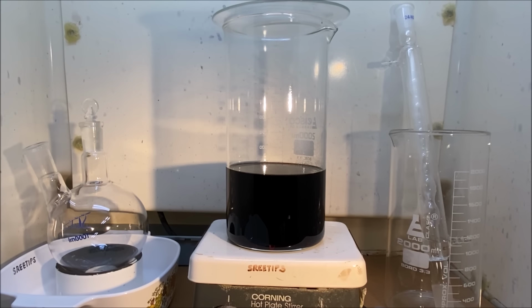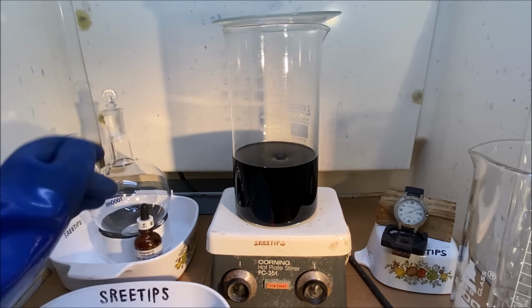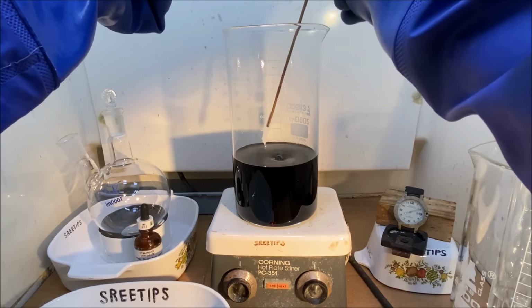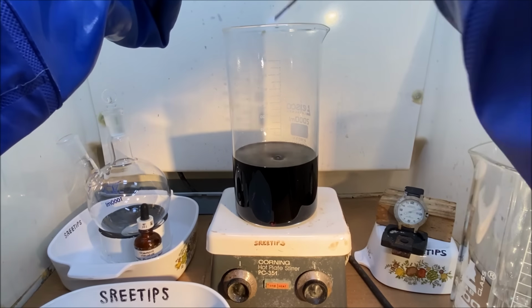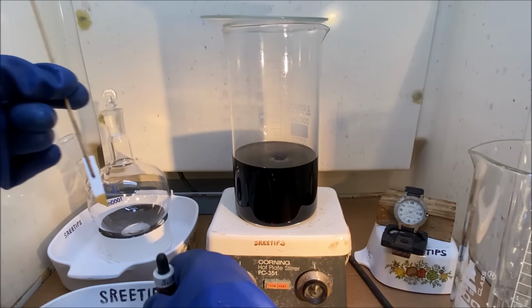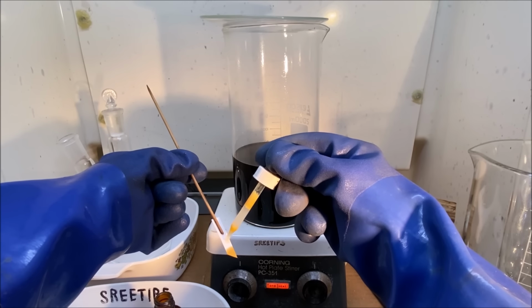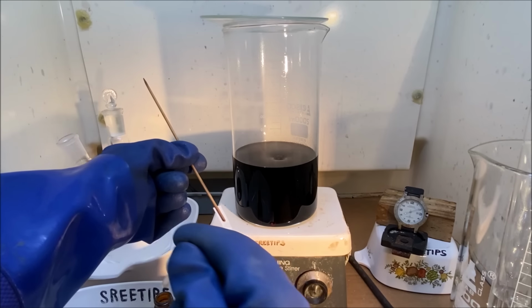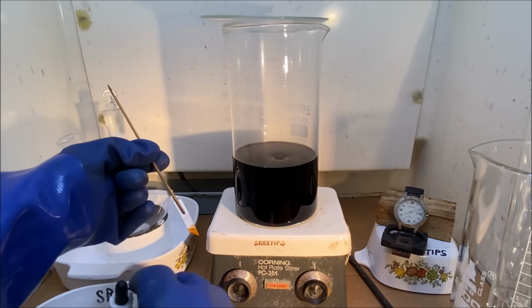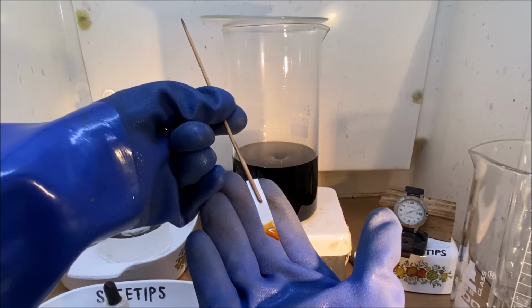I'm going to try to evaporate this down until all the fumes are gone to get rid of the excess nitric. Before I get too far into this, I'm going to reach in here and get a stannous test. See where we're at, just to get a baseline on how this is going to look. Nice orange color.